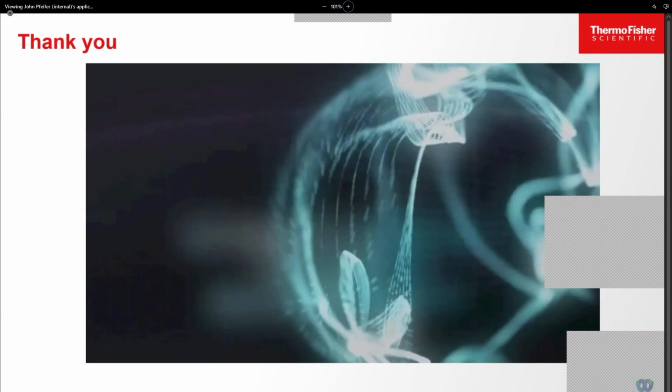Next question, is contamination an issue? Well, it could happen. That's not specific to TaqMan, of course, but contamination could affect just about any assay. Generally, when it comes to diagnostic assays, contamination is a much greater concern than for a research assay like gene expression. As I said in one of the earlier slides, with gene expression we can tolerate a little bit of contamination. Generally, our scientists say 1% or less, because a 1% error is not going to affect your statistics, like if you're doing a t-test.